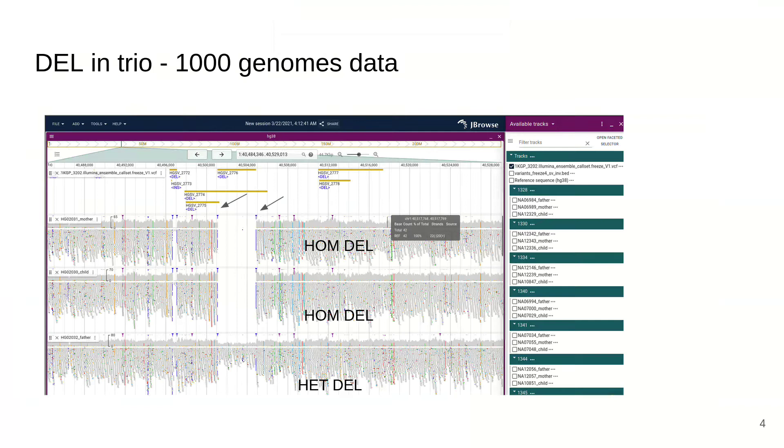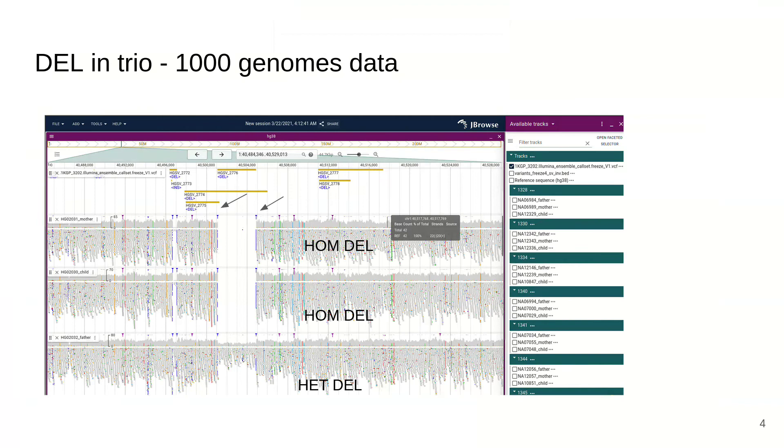This screenshot shows exploring a deletion from a trio dataset with a mother, father, and child. In this case there's a homozygous deletion where there's a total lack of coverage in these two samples but just a drop in coverage from the other sample. Interestingly, you can see these blue markers would show an excess of soft clipping. The purple shows an excess of insertion.